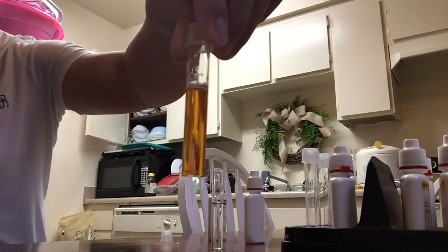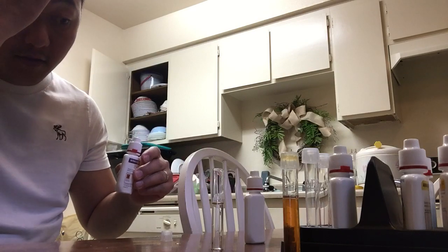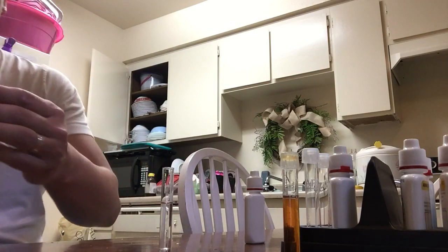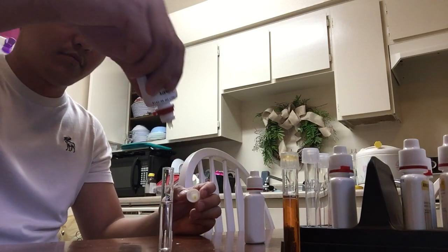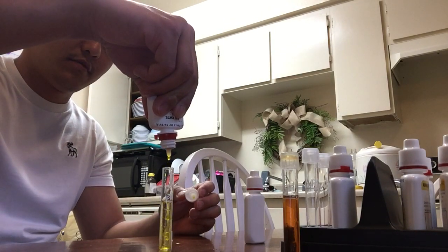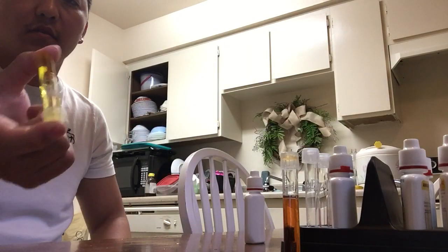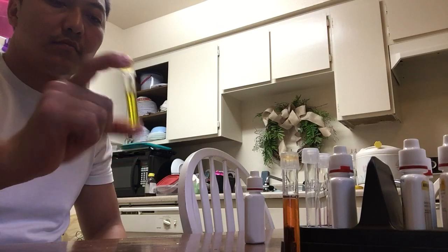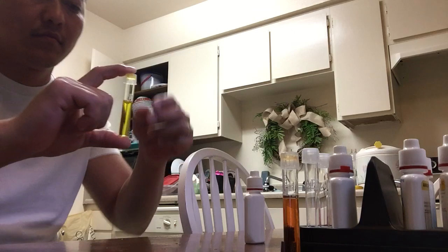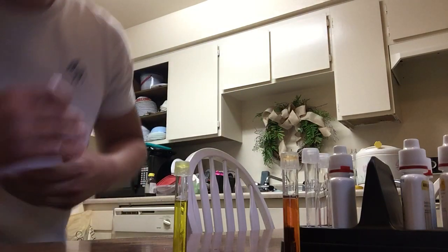It's mixed now, we'll let it sit for five minutes while we test the filtered water. Bottle one again — we'll mix that again. And bottle two, we'll shake it for 30 seconds again.